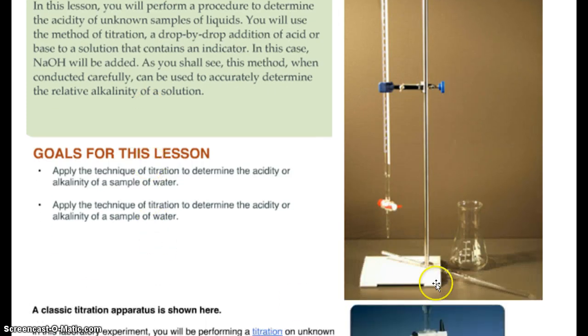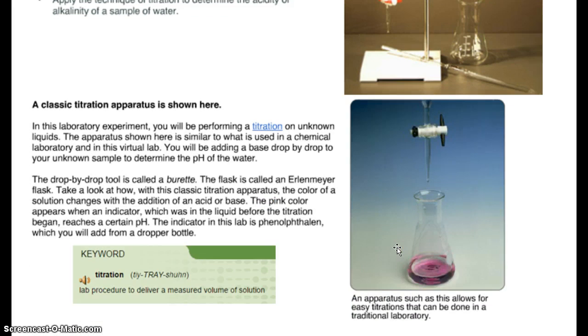So this is what it looks like in real life. This is just called a ring stand, so they just use it to attach the clamp to hold this thing up. This thing is called a burette, and it's glass, and they cost like $100 each. And there's little tiny lines on them that say 1 milliliter, 2 milliliters, like that. And then you can open and close the valve here to allow one drop at a time to spill into the bottom. Except usually the flask is underneath and you're catching it. So here you go. So the flask would be underneath. You'd open up the valve and let one drop at a time go through.